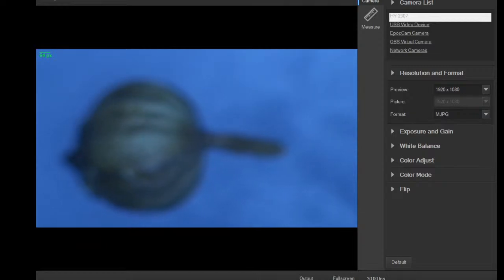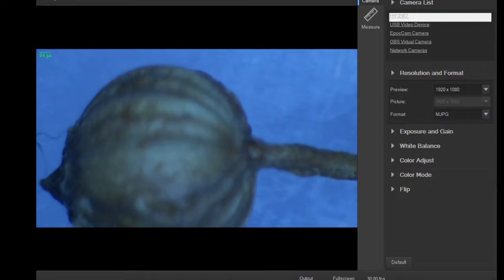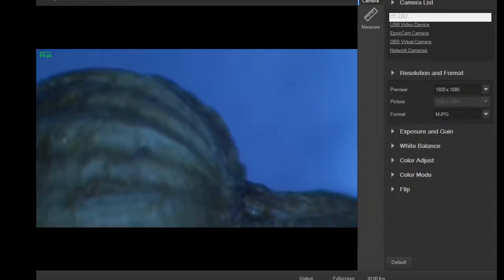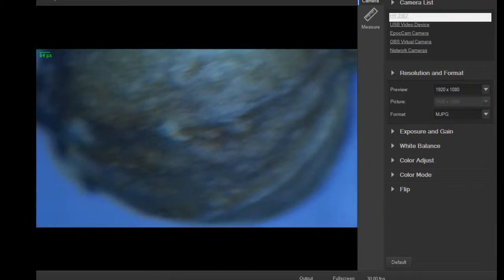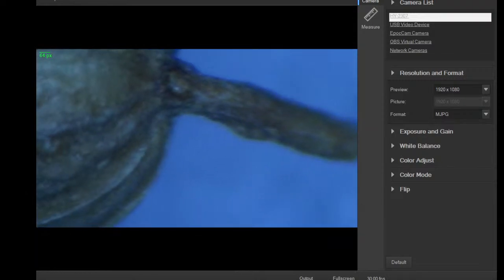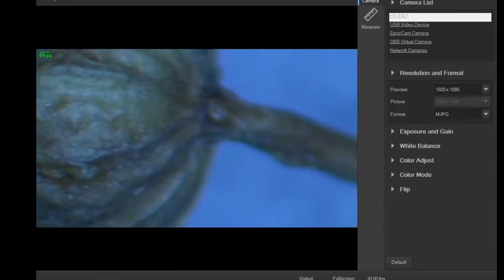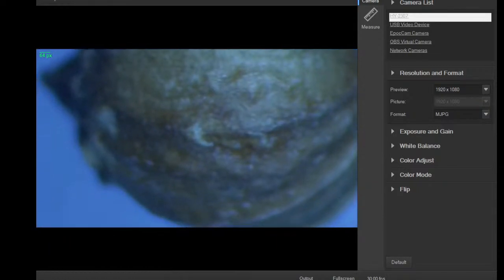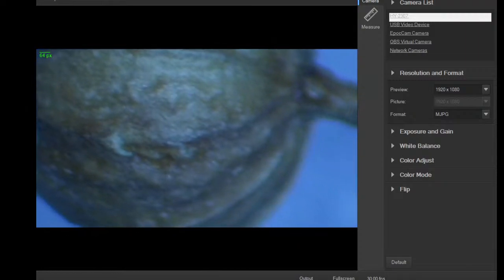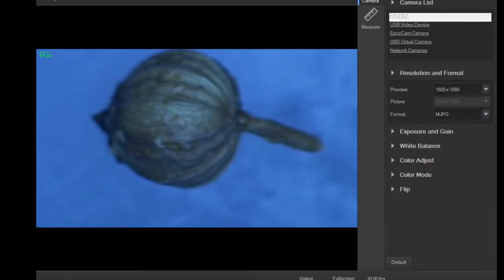So there's a little stem on the coriander. So clearly this is the fruit. They call it coriander seeds because, you know, they didn't bother to strip off the little bracts that are holding the stuff together, but this is essentially the coriander fruit, and the seeds are inside of it, and it's just dried. But they call them coriander seeds anyway, so that's fine. Not going to get pedantic about it. But that's coriander. Kind of fun.